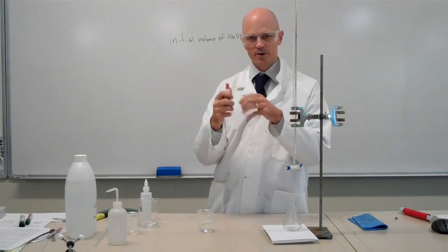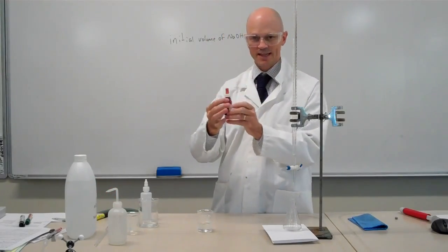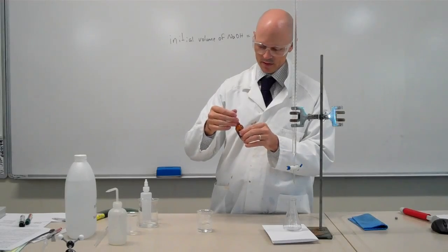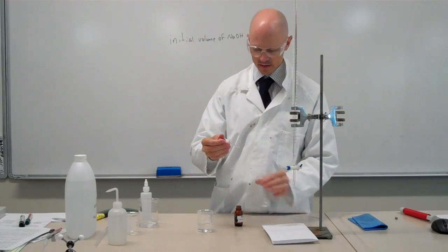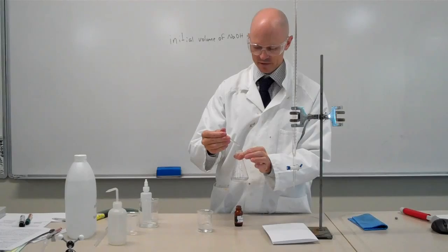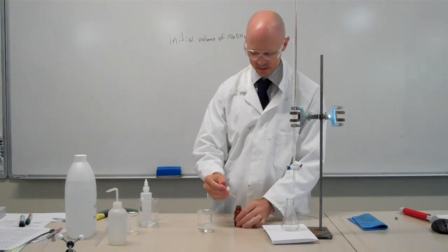The indicator I'm using today is phenolphthalein. Adding two drops of phenolphthalein to my vinegar.